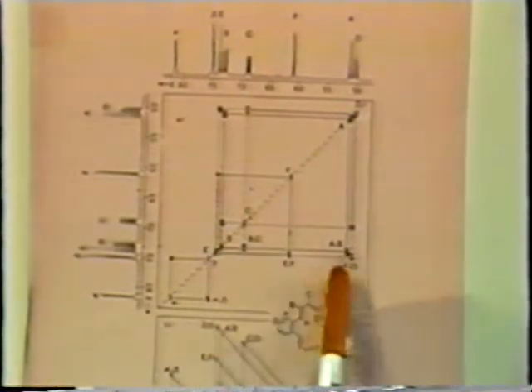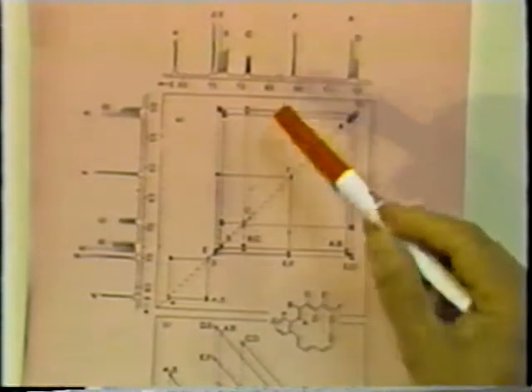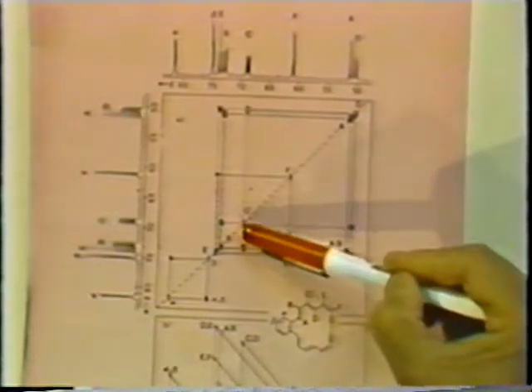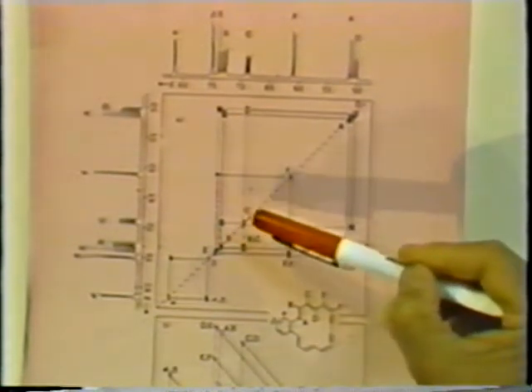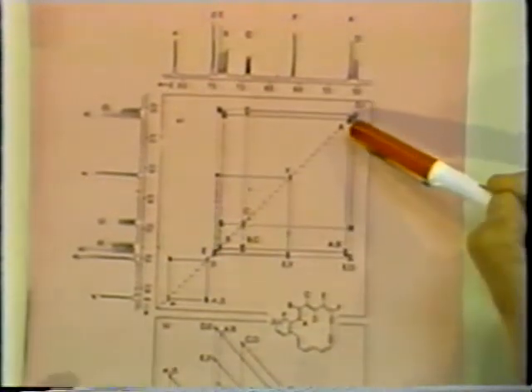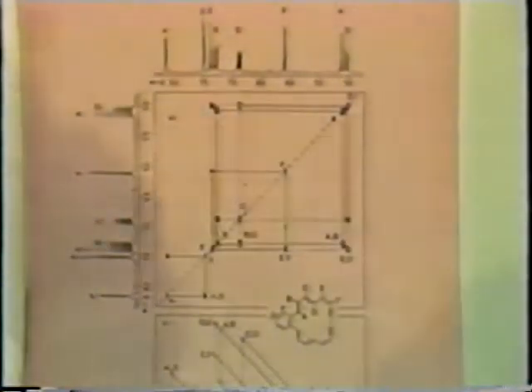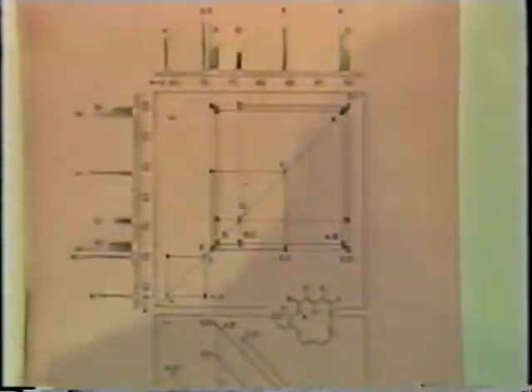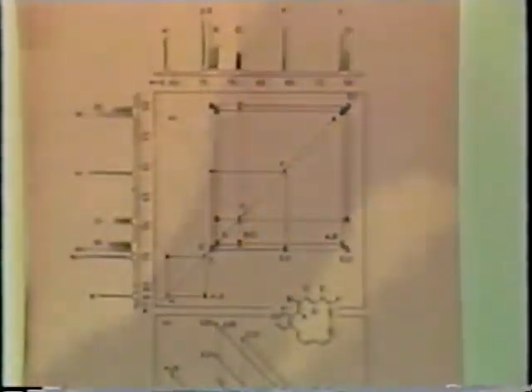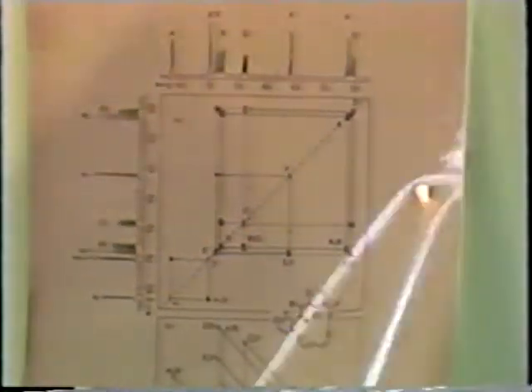So that is the D resonance. And D has another cross peak, which is the C resonance. And C has another cross peak, which is the B resonance. And B has one more cross peak and the A resonance. So basically you can walk along this COSY spectrum and do the assignment. It's essentially one experiment, one set of instructions which you give to the computer and run it. You don't have to know where to radiate or how much power to use, because the 90-degree pulse is the same for all. So I must tell you that it's indeed easier to run a COSY than a decoupling experiment.